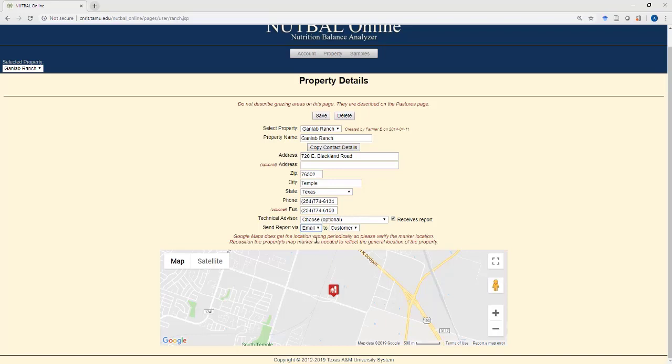Just remember to select that option, hit save, and the next time we receive a sample under this profile, we will email it to you.